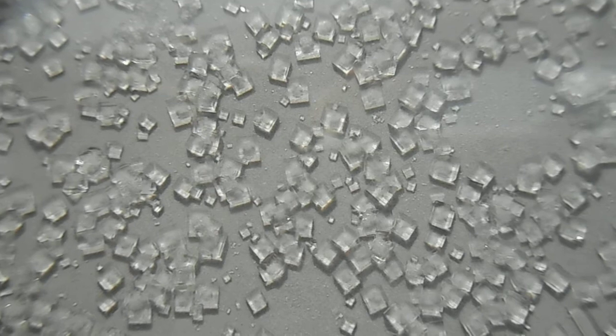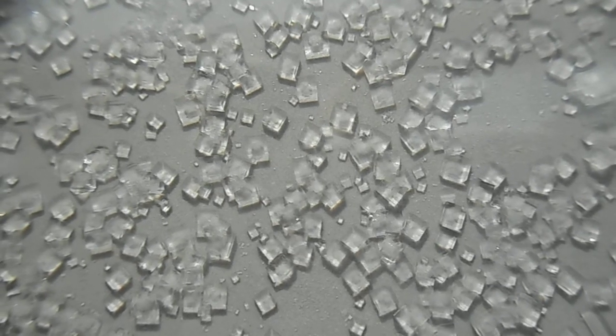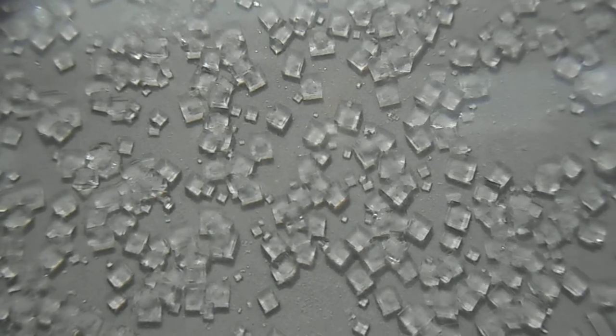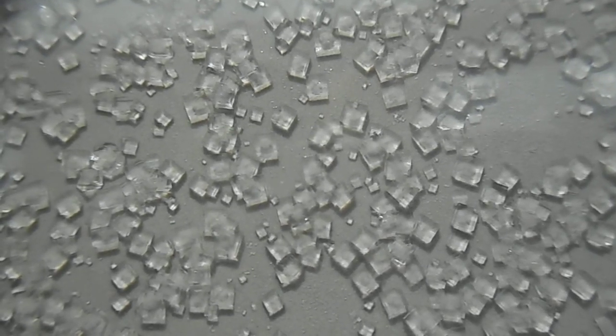Re-crystallization of sodium chloride. Here are the crystals formed from a saturated solution of sea salt. What shape are the crystals?